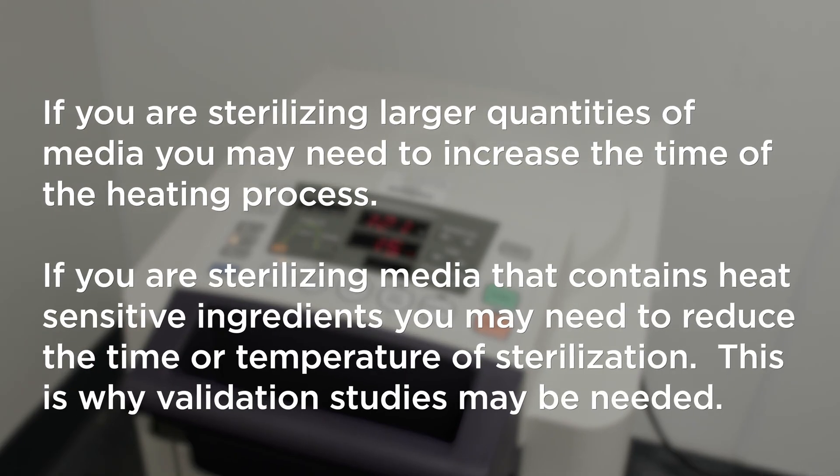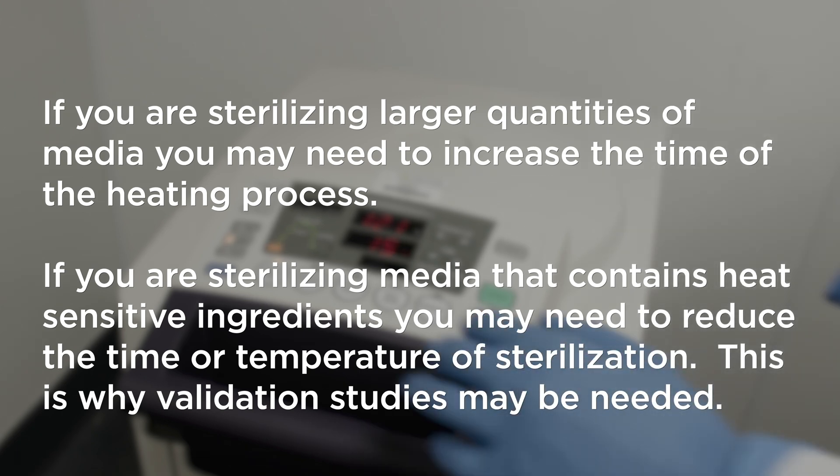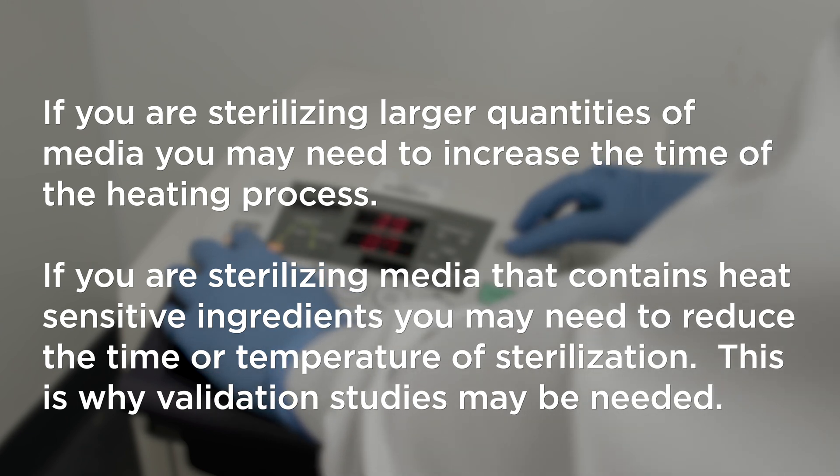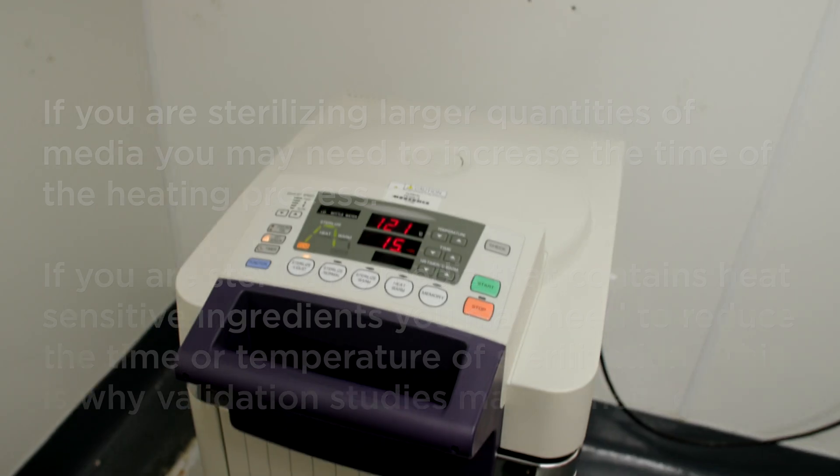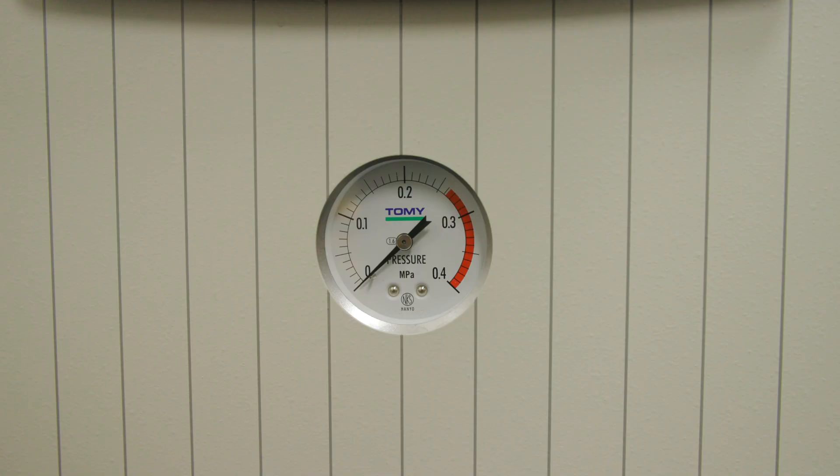If you are sterilizing large quantities of media, you may need to increase the time of the heating process. If you are sterilizing media that contains heat-sensitive ingredients, you may need to reduce the time or temperature of sterilization. This is why validation studies may be needed.